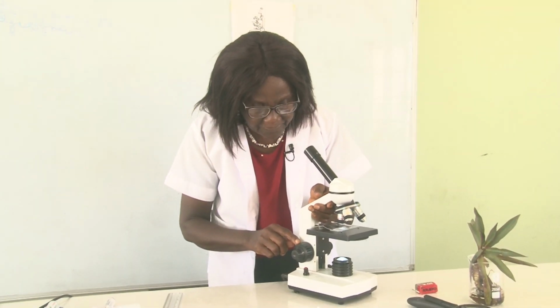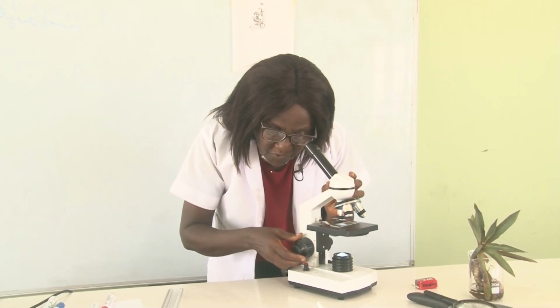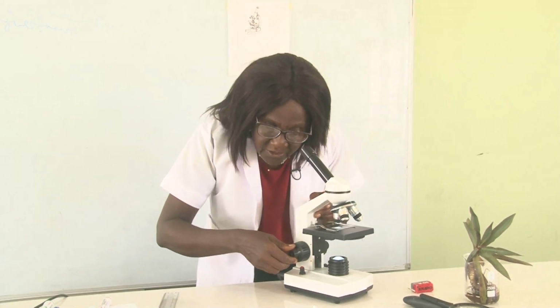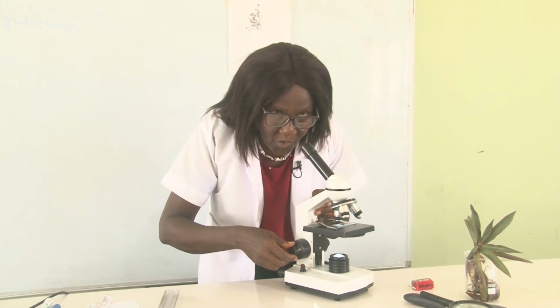You need to regulate using the coarse adjustment knob, this is it, to bring the image into focus. Then you use the fine adjustment knob to bring the image into sharp focus.